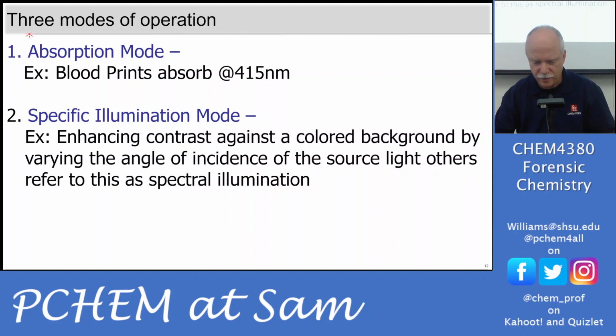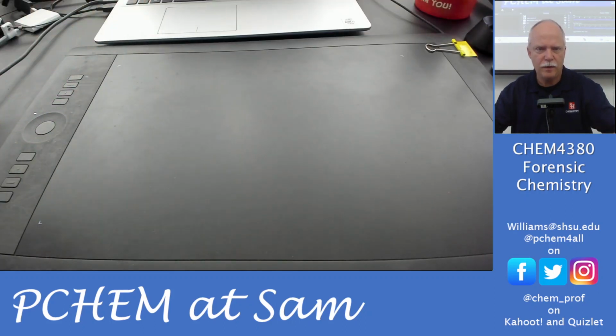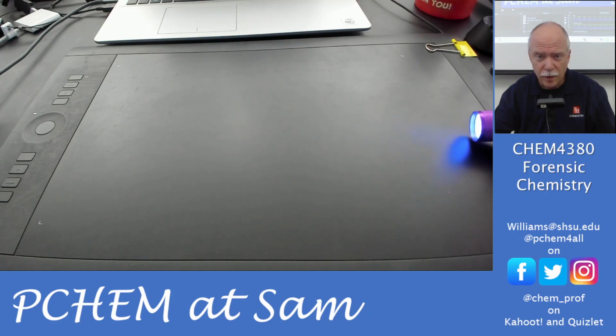Let's see if I can. Yeah, you can see it. Okay, grazing angle. I don't have a white light, but you can certainly see the particles here. So I'm looking at it with a grazing angle. Let me turn this camera on. Let's see. I don't know if you can see it. I'm trying to find out where. Maybe if you'll turn the lights out for me.